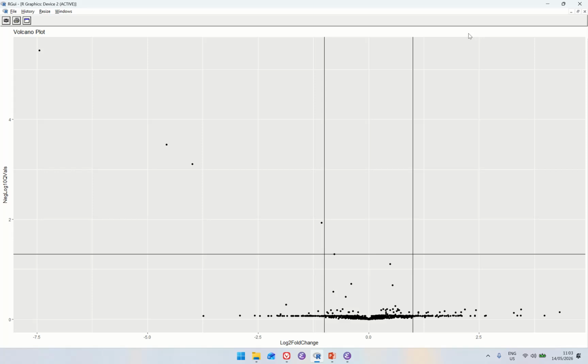Well, yes, you can just fix it in your R code so it renders to exactly what you want it to be. But if what you're doing is something a little more selective, maybe you really want to draw attention to points 1, 2, 3, 4, and 5 here. The easy thing to do would be to pop this into Illustrator, for that matter, and just change the color of those dots. This is not hard to do, but if you have it as a PNG, it's a bitmap, not an editable drawing that you can deal with in Inkscape or Illustrator. It is possible in ggsave to save stuff as an SVG.